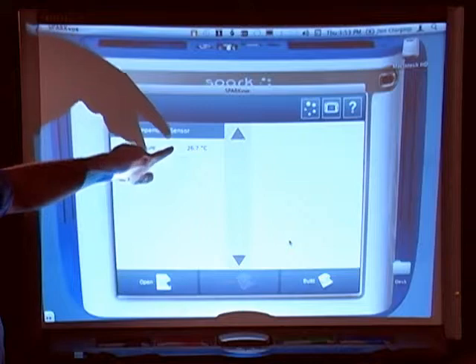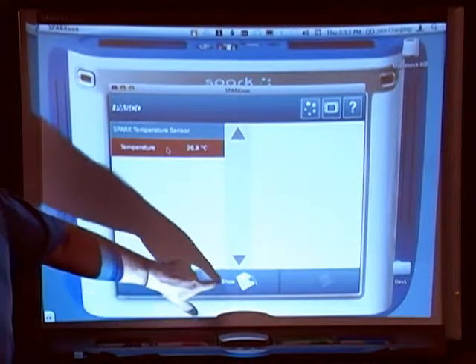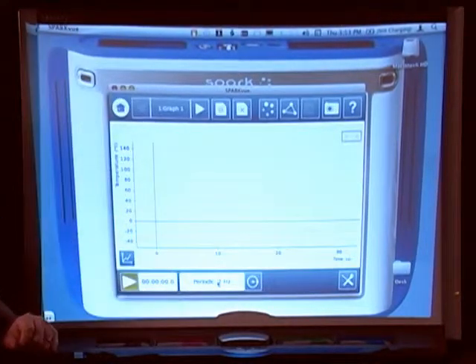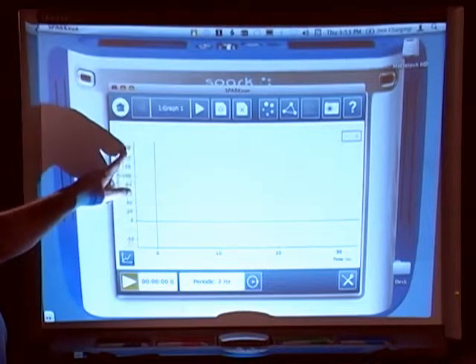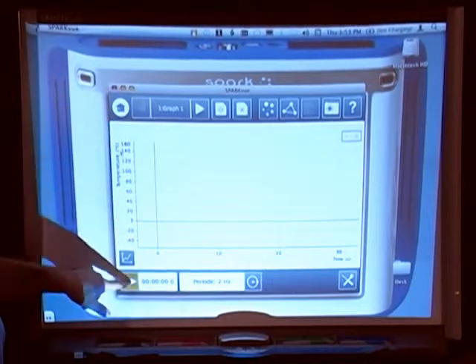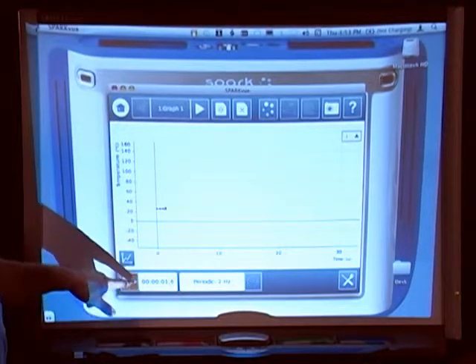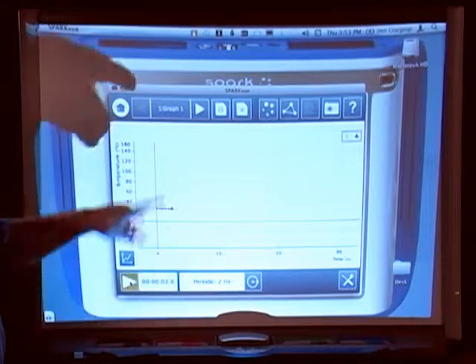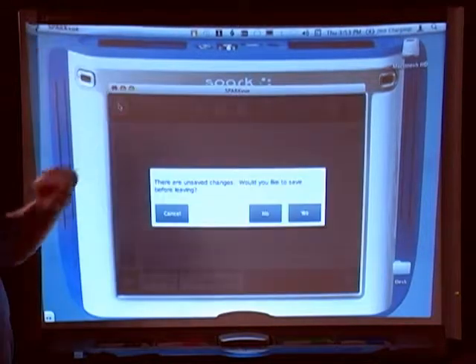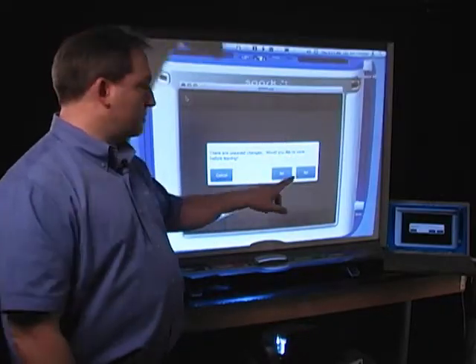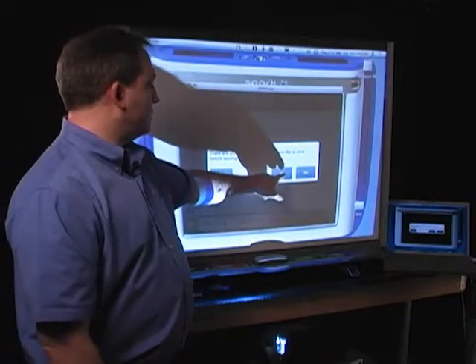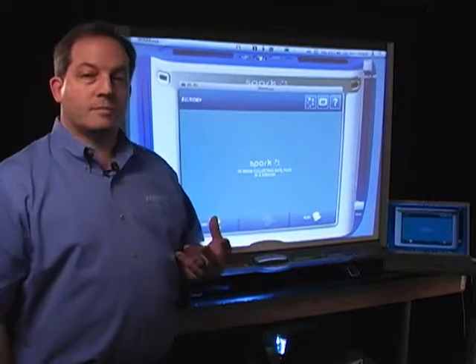So I can do things like interact with a measurement, bring up a graph, interact with that graph, start and stop data collection, and jump back to my home screen. All on the screen, just as my students will be doing on their device.